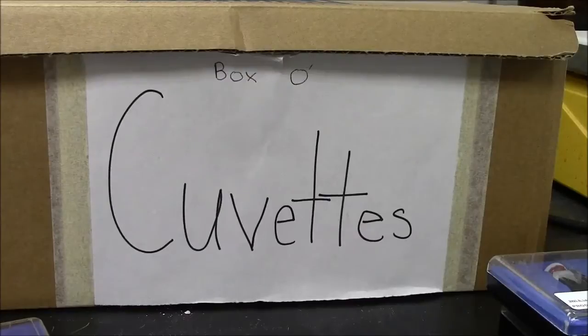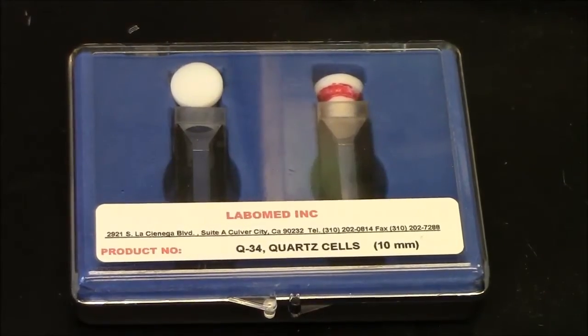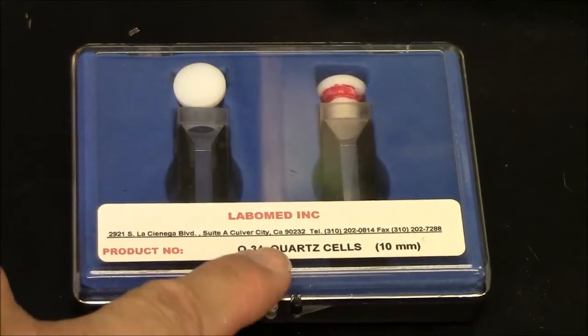To start doing UV spectroscopy, you need a cuvette. Cuvettes can be made of plastic, optical glass, or quartz.